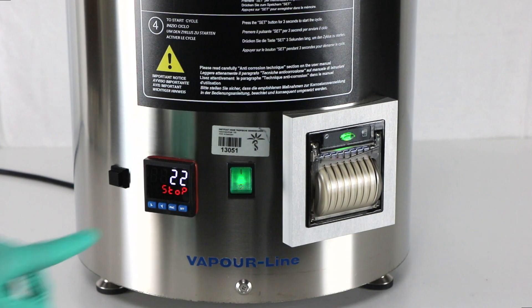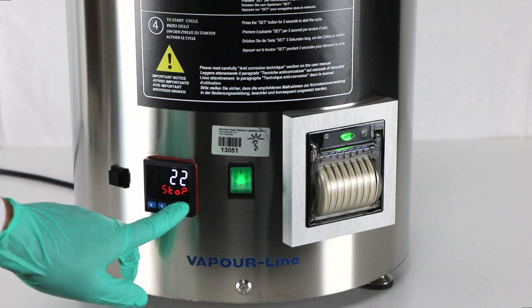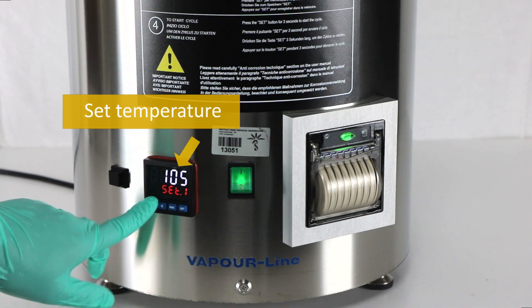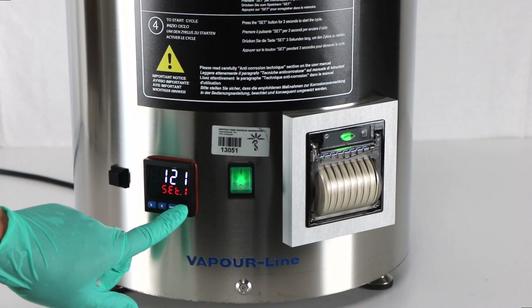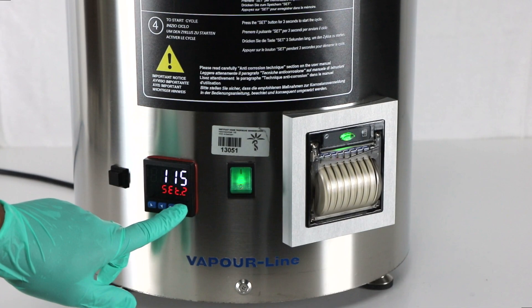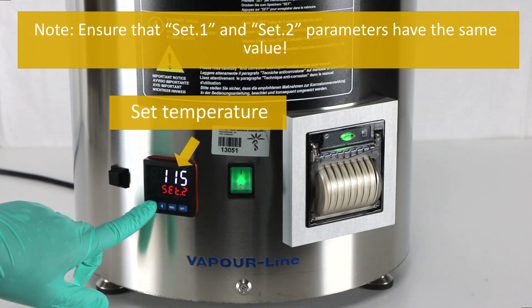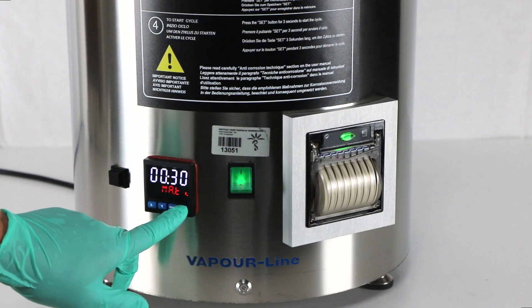Set the sterilization temperature: press Set on the command panel until Set.1 appears on the lower display. Use the arrows to increase or decrease the temperature. Press Set to save to memory; the parameter will be stored even after the device is turned off.